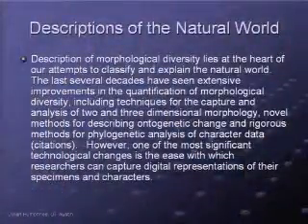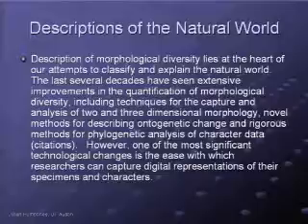Okay. And so I'm going to talk today about a facility at the University of Texas in the geology department that has a high-resolution X-ray scanner capable of scanning small, medium, and somewhat larger size objects at very high resolution with lots of X-rays and photons that result from those X-rays.